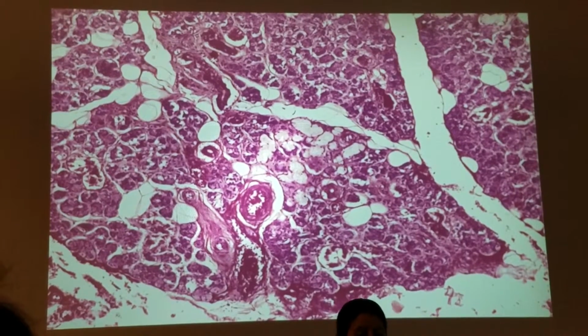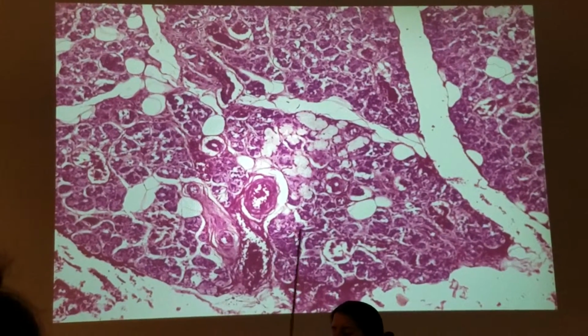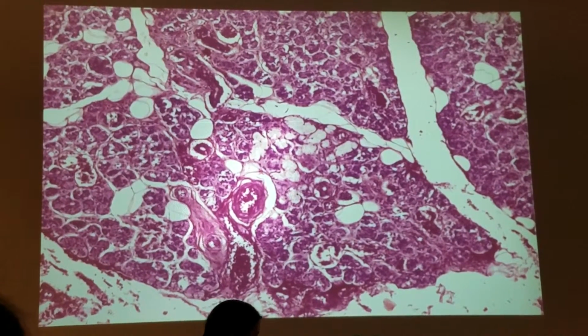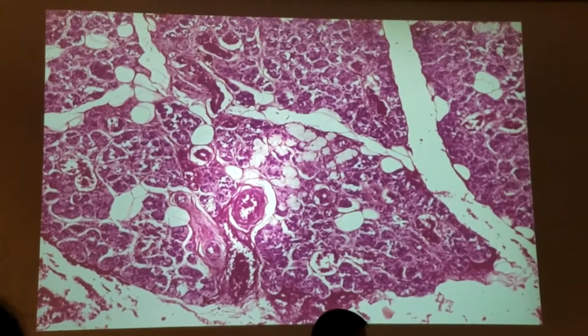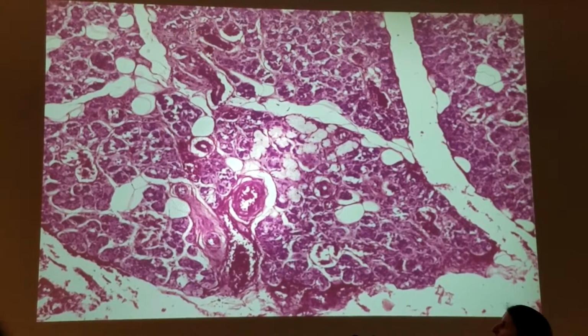Okay, so the 3 types of cells. The mucus acini, there's not very many mucus acini in these slides, and you kind of have to look toward the edges. If I remember right, that's what we had to do last semester.